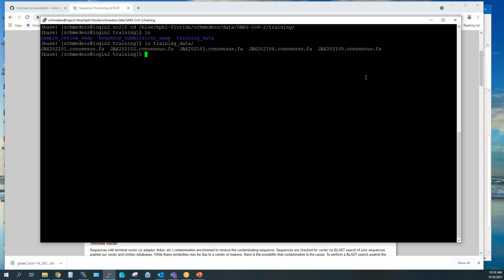So what I recommend, I've already made these 2 folders up here just in case, because I'm going to run them, and that way we don't have to sit here for like 5 minutes. Vader should only take like 5 minutes or something to run on these, but that way I can go to this to show you what it looks like after it's run.